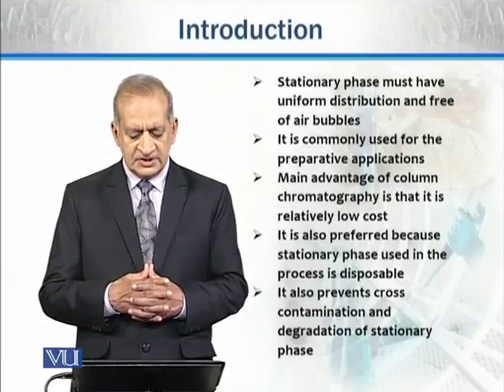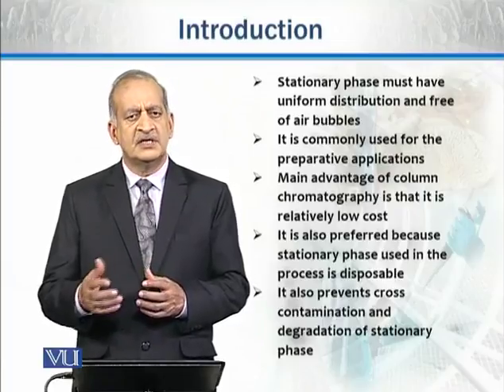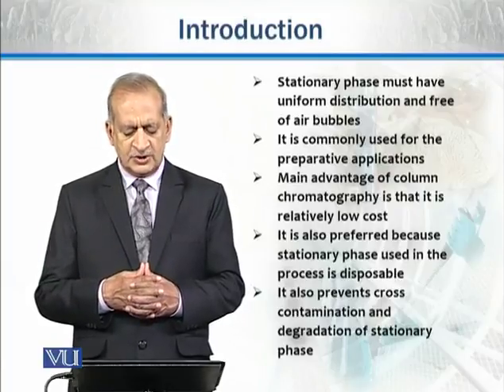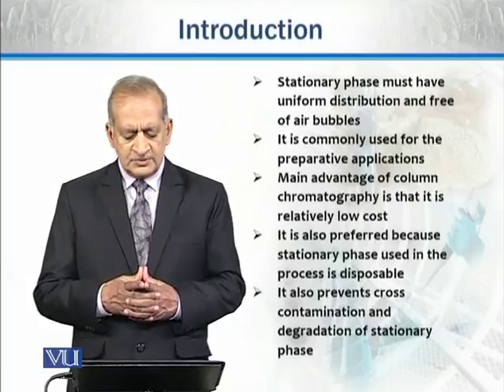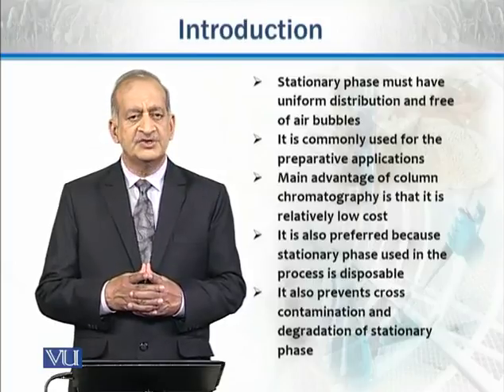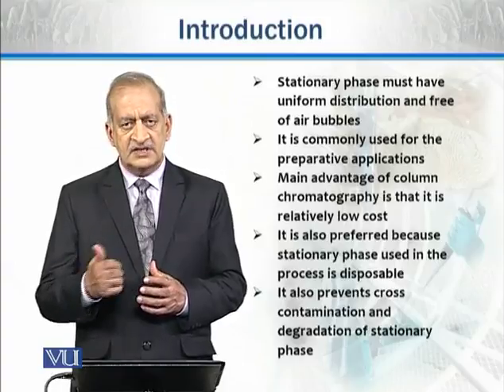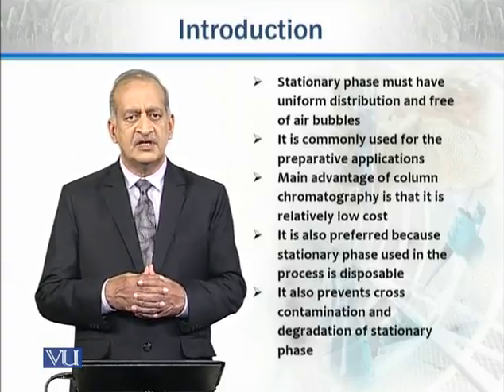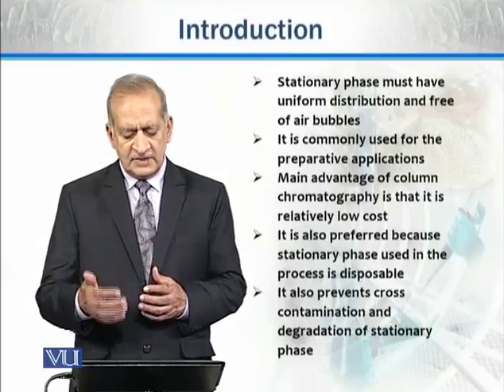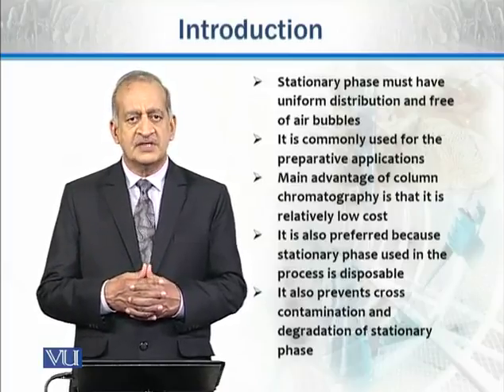It involves low cost. It is also preferred because the stationary phase used in the process is disposable. We use it once, twice, and then it is disposed of. It also prevents cross-contamination and degradation of the stationary phase. Obviously, the chances of contamination are lower, and similarly the stationary phase does not degrade. So in this way, this is carried out. It has applications, it has advantages over other methods for the separation of various components of a mixture.